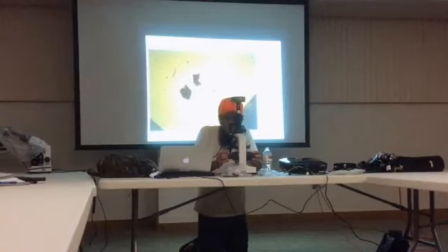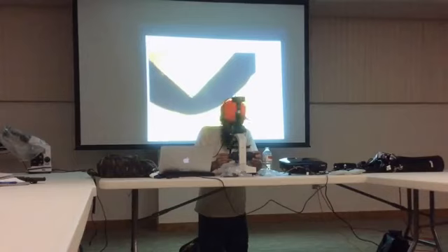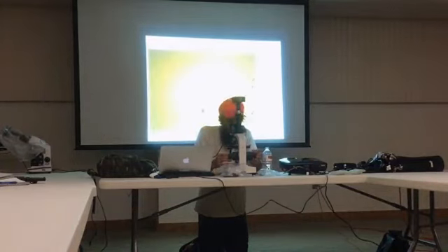And this is the edge of my slide. You guys see that? That's the edge, so I can see from edge to edge, just kind of cruising across my slide. See if I see any nematodes.